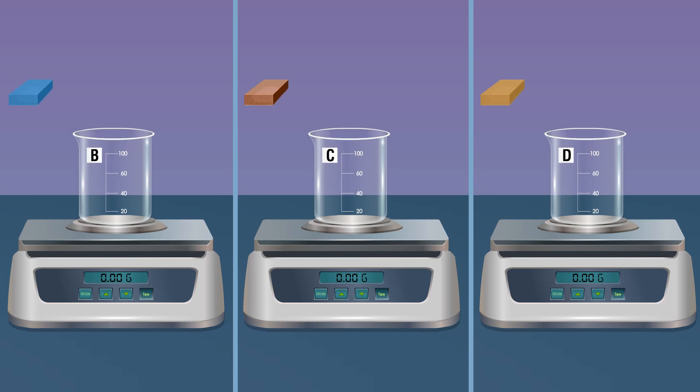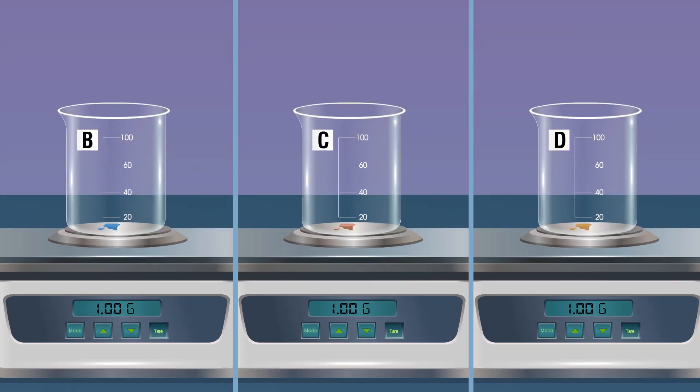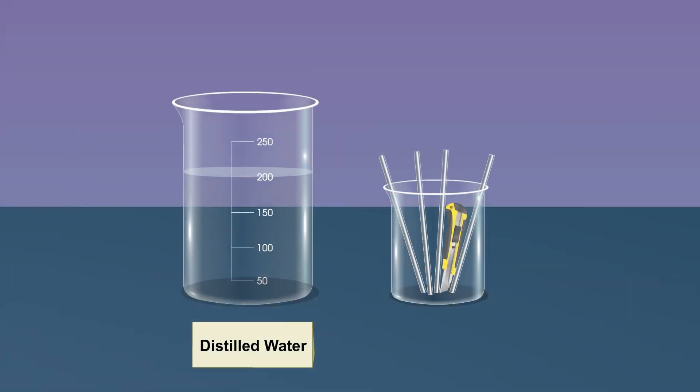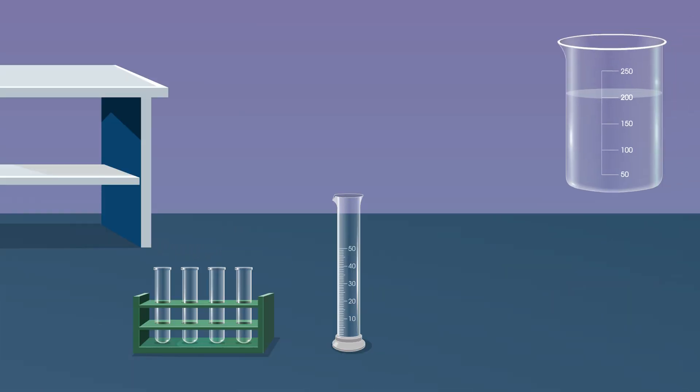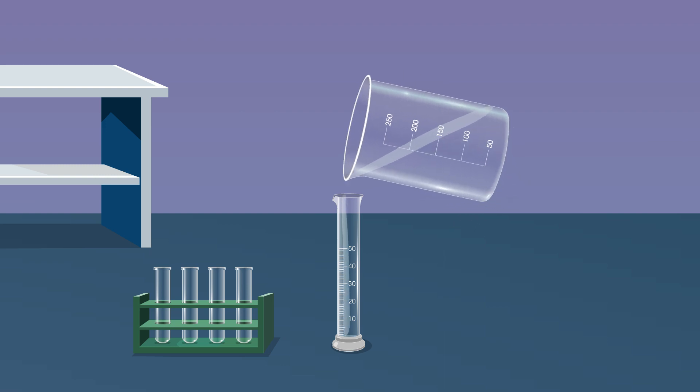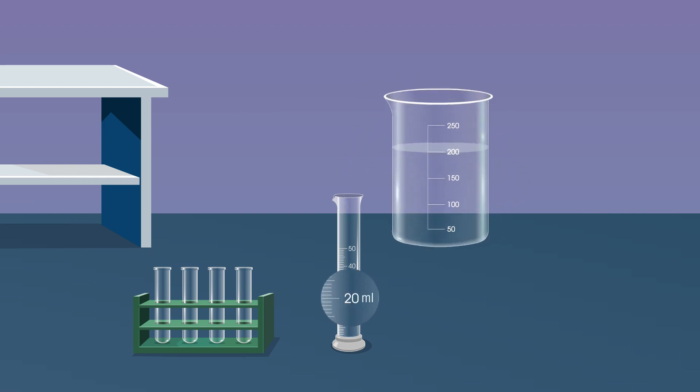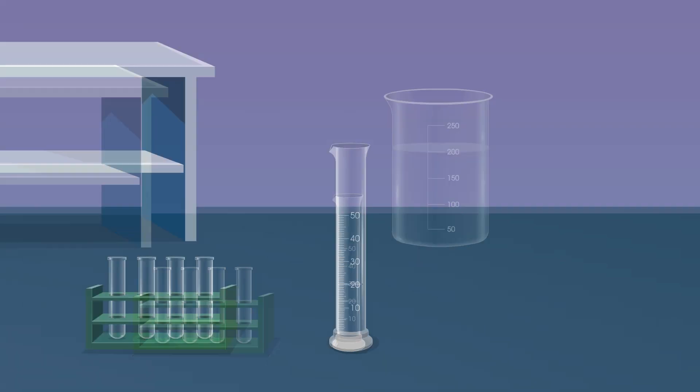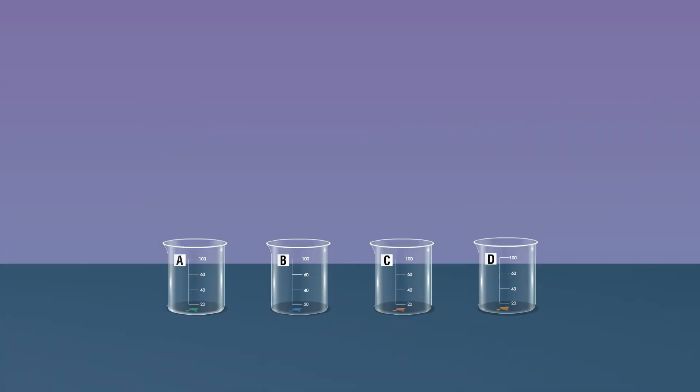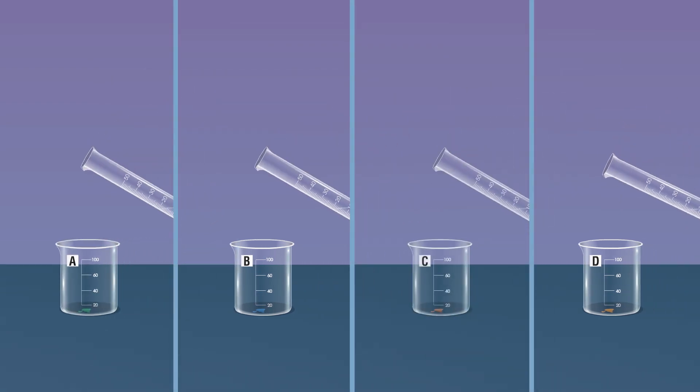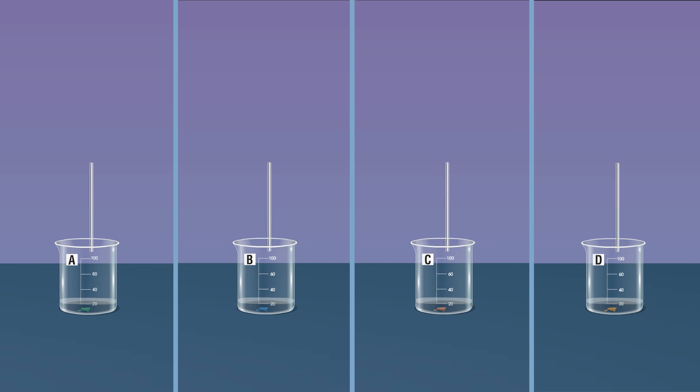Add 20 ml of distilled water to all the soap samples using a measuring cylinder from the beaker containing distilled water. Dissolve the soap in water by stirring the mixture with a glass rod.